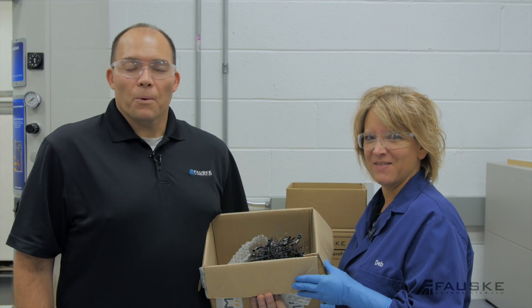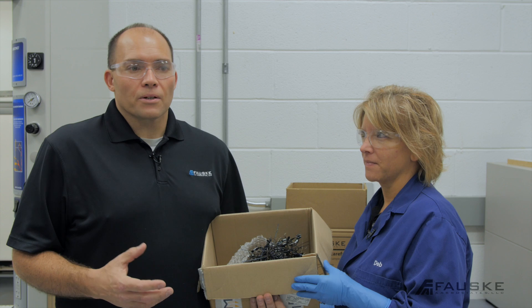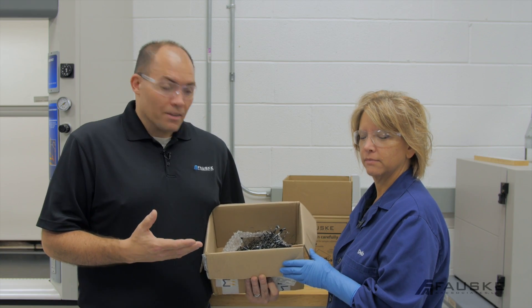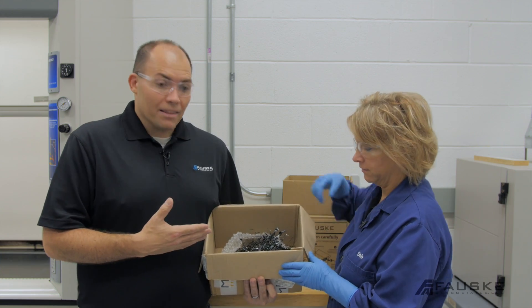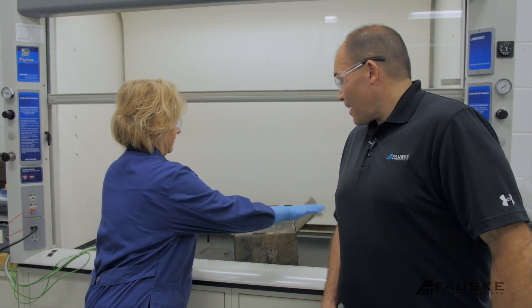So let's take a look at the samples that have come in — some the wrong way, others the right way. When we receive the material, we want it to be light, fluffy material, things that are going to stay lofted in the air. Some examples that show up at our lab that people think we can test is something like this. That's not going to work. We've had some samples arrive just loosely in a box, and that's not going to help anyone, especially the paperwork that's inside.